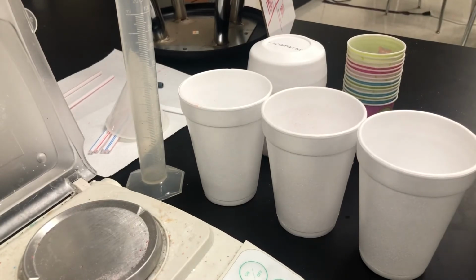And so you have to come up with the number of moles of Kool-Aid that are needed in each cup. But notice each cup is starting out with a different amount or a different molarity in each solution. Your cup number 1 is a 0.1 molar solution. Your cup number 2 is a 0.4 molar solution, and your cup number 3 is a 0.7.